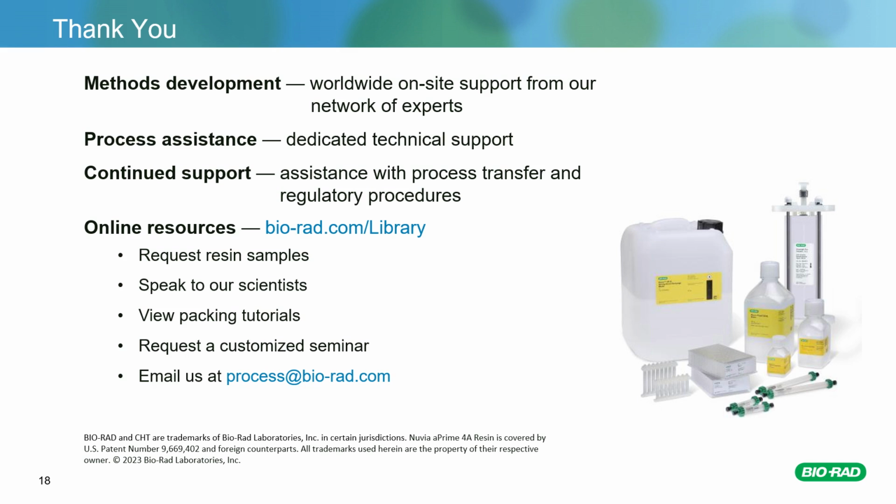For high numbers of factors, typically above 9, the main objective is to find those showing significant impact on tested responses. It's called a screening design. Factors with non-significant effects can then be eliminated from the next round of testing. The main objective for the next, more in-depth testing is to find interactions between factors. This is known as a modeling design, and you will be looking to test between 4 and 9 factors there.